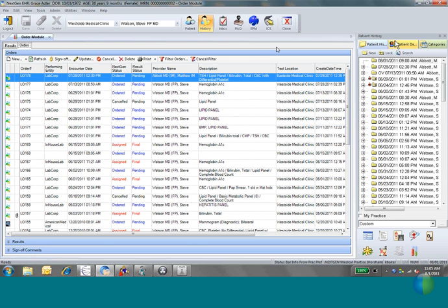So before we get into the actual setup of it, which is really the majority of what we're going to be doing today, I also want to stress one point with you guys. At this point in time, the orders module can be used independently of any templates. You can use all of your file maintenance setup and begin using the orders module right away. As soon as everything with your interface is done, you really are ready to go.